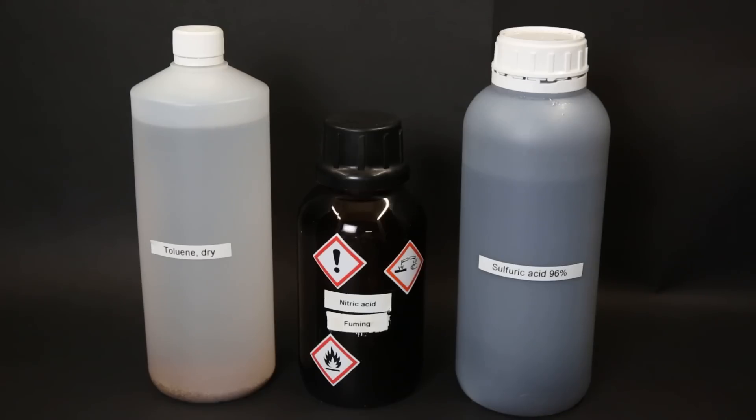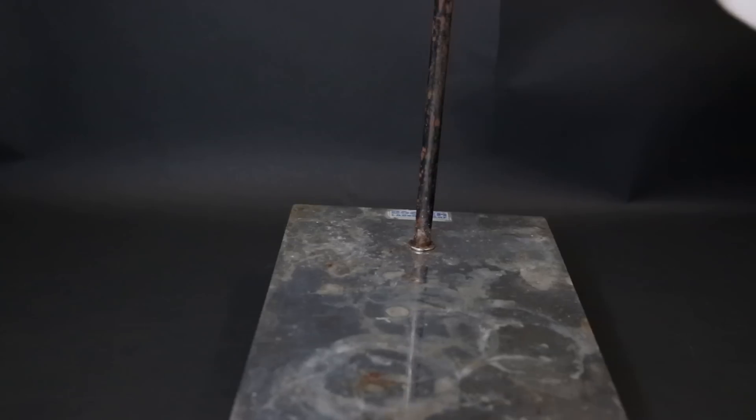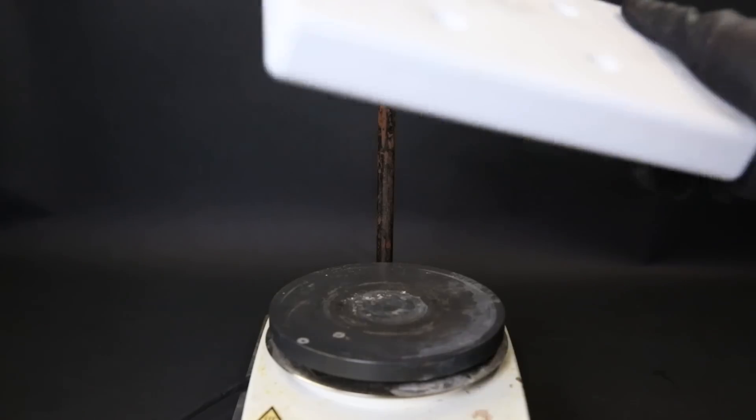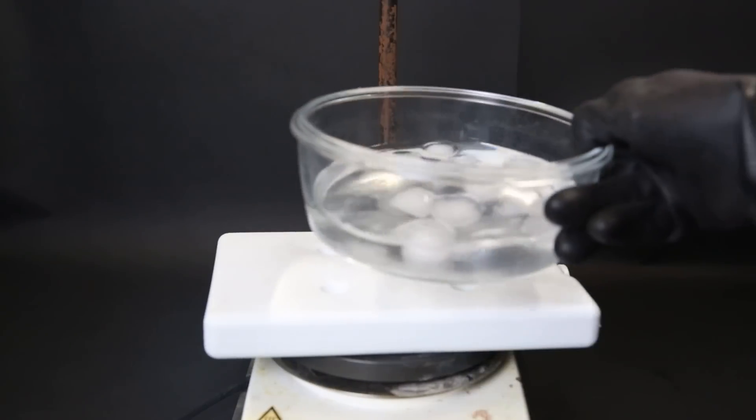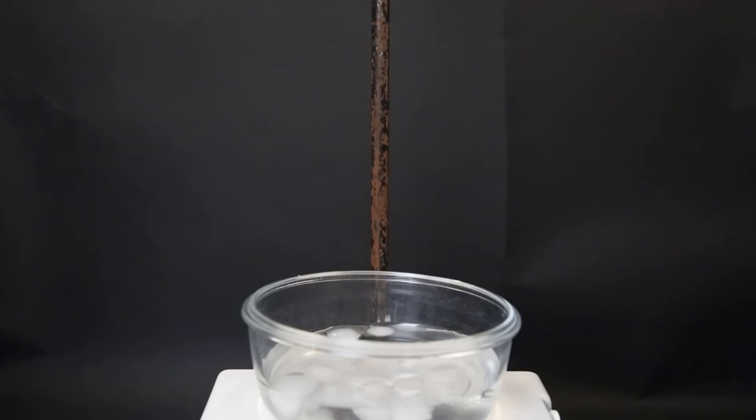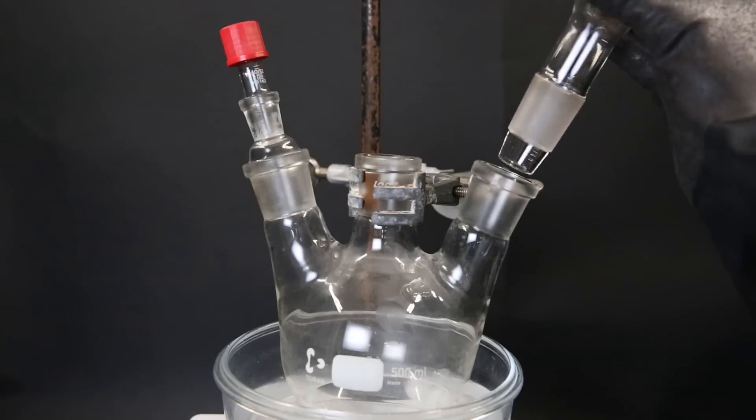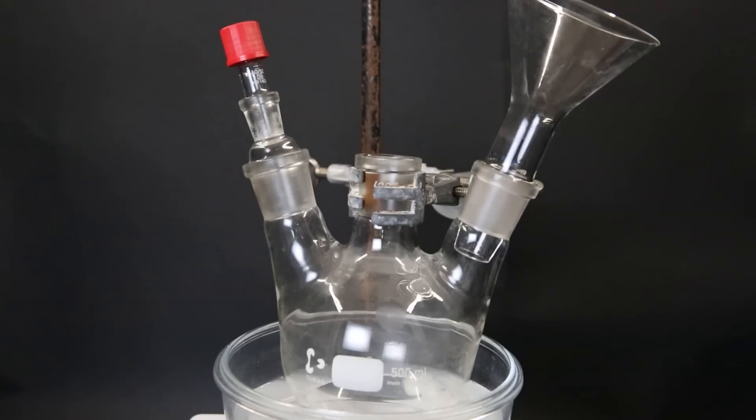To start off, I need to do a mononitration of toluene in the para position. To do this, I will need 96% sulfuric acid and 65% nitric acid. I set up a stir plate with an ice bath. For this reaction, it is important to keep the temperature below 10°C because above this temperature, the toluene will nitrate in multiple positions. So I set up a thermometer adapter.